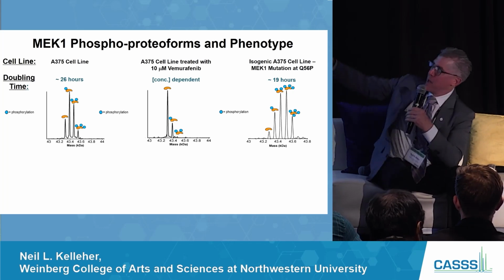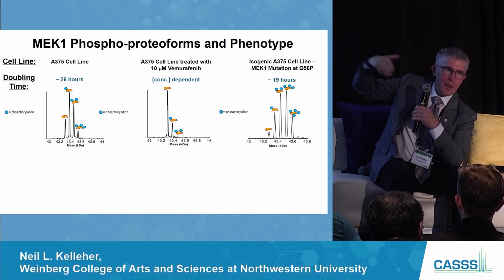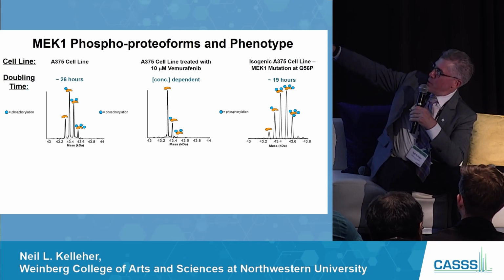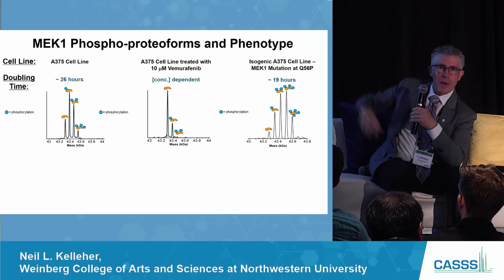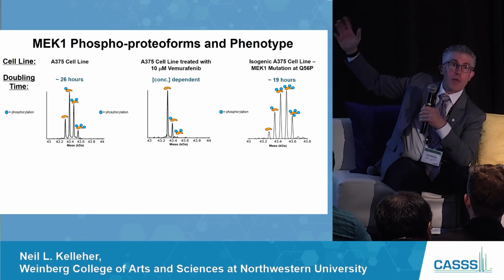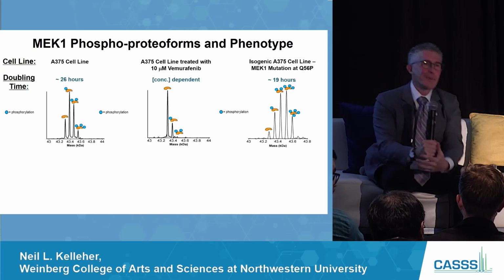She wants to test how much these patterns link to phenotype, right? Is the patient responsive to the drug, so it would look like that middle spectrum, or are they in relapse and the drug's like, you're not looking good. That's what I really want to test. Yes, great question.